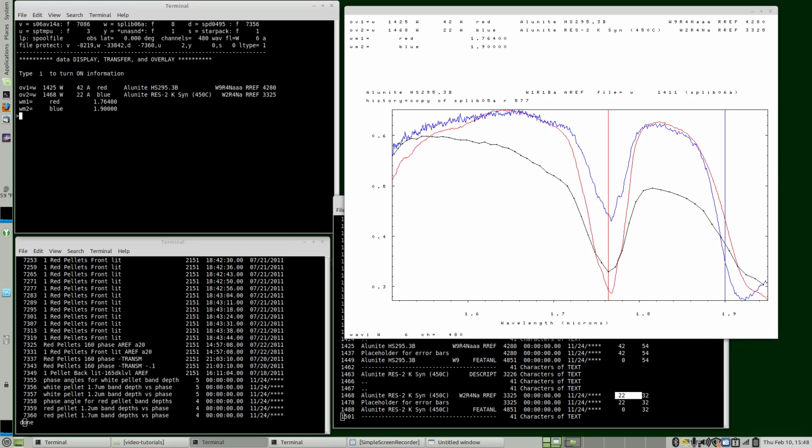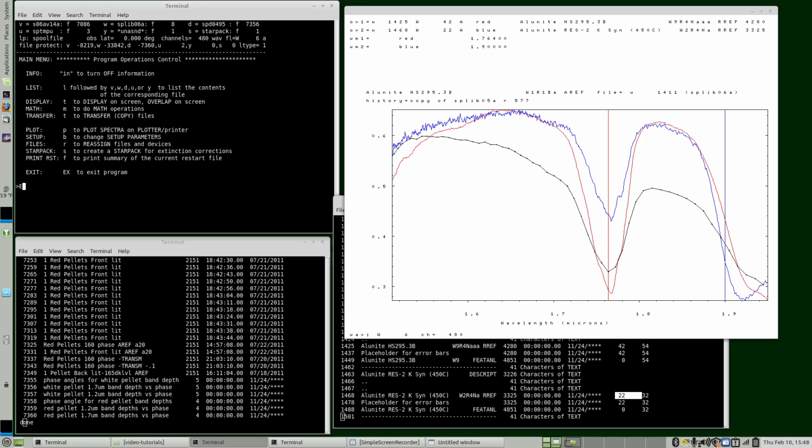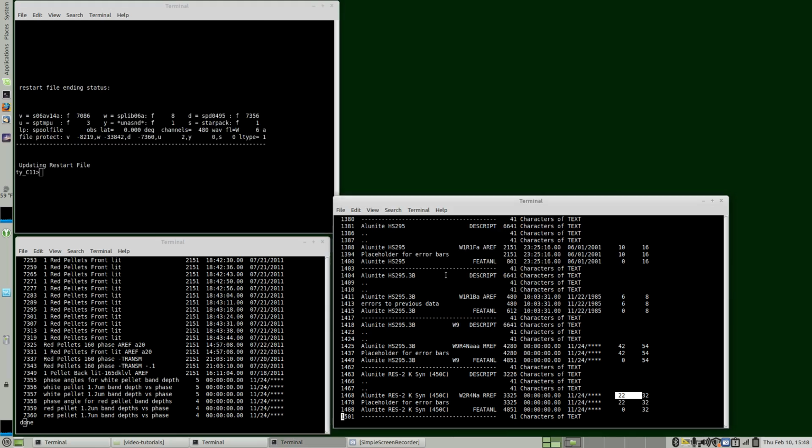Okay. With that, we'll exit. It's a good introduction to plotting capabilities in Specpr.